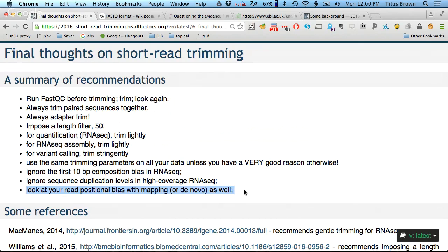Now you might think this is all very paranoid or not, I don't know, I can't tell. But something to keep in mind is that once you've done all of this and you're satisfied with it, you don't need to think about it anymore. You rest solid on the fact that you've done the necessary controls, in a sense, on your sequencing data, and now you get to worry about the actual rest of things, which is assembling or variant calling and then doing downstream analyses.